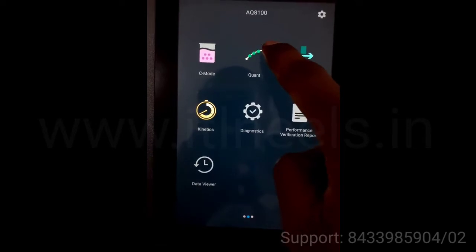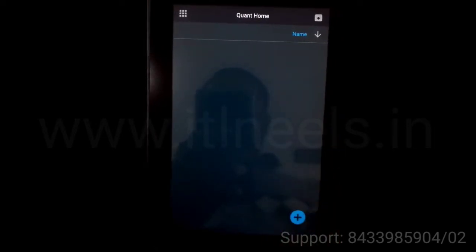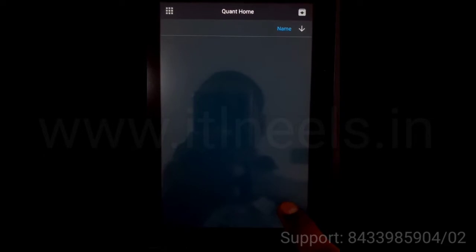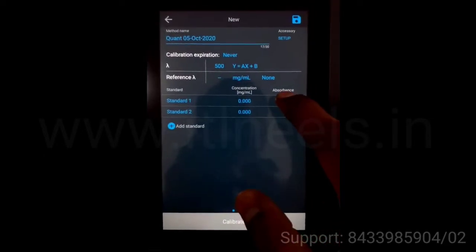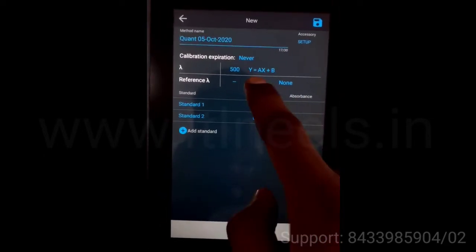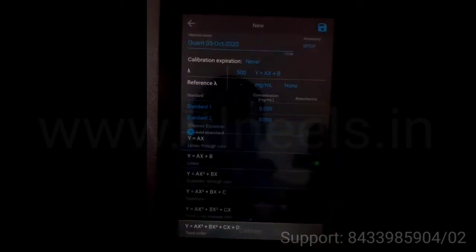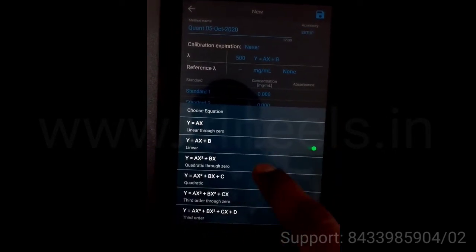Next mode is Quant. This is used for multi-wavelength calibration and curve development. You can change the equation from here.